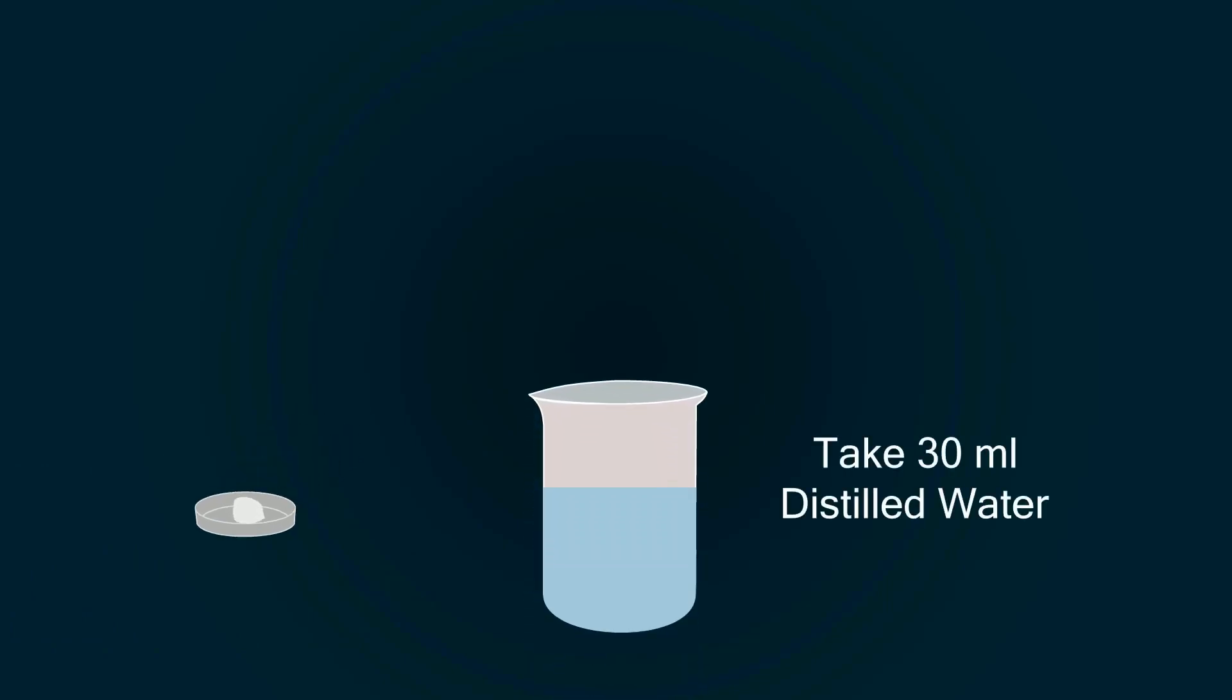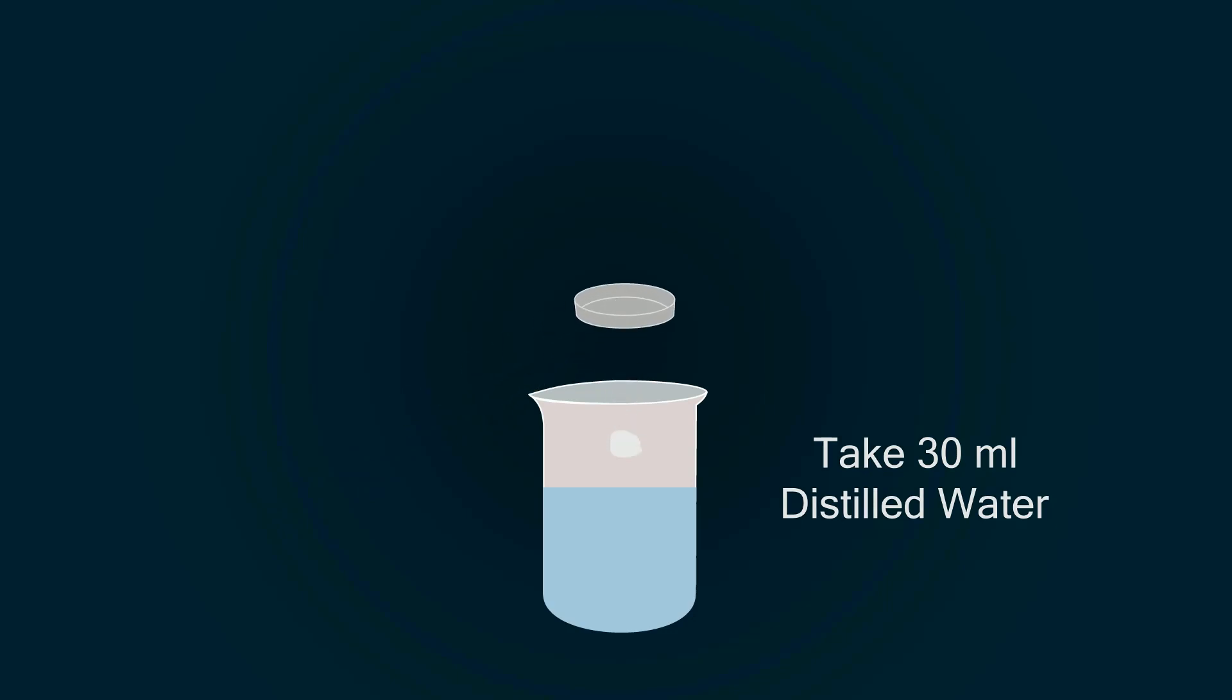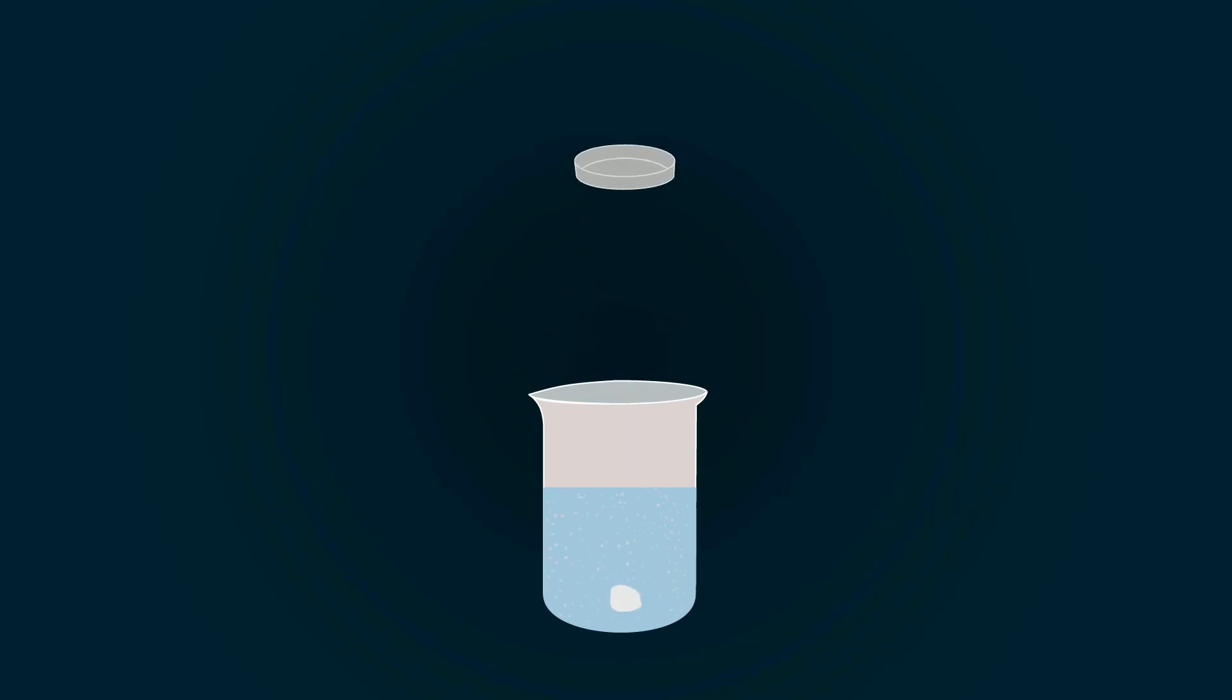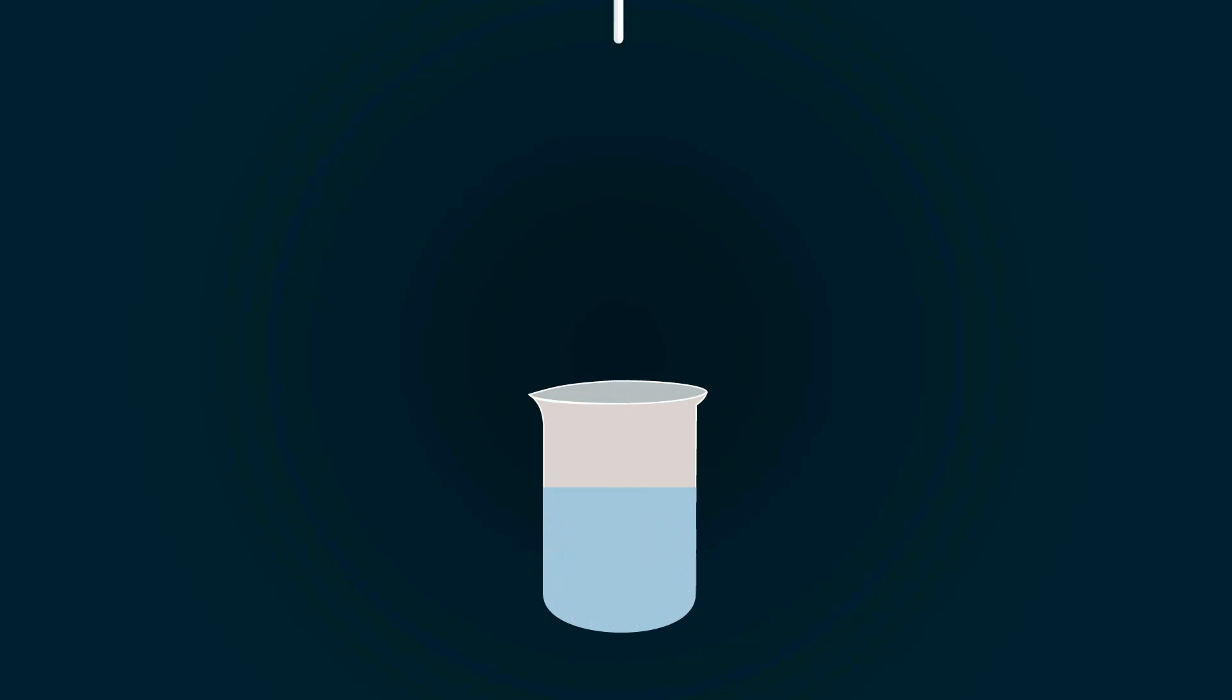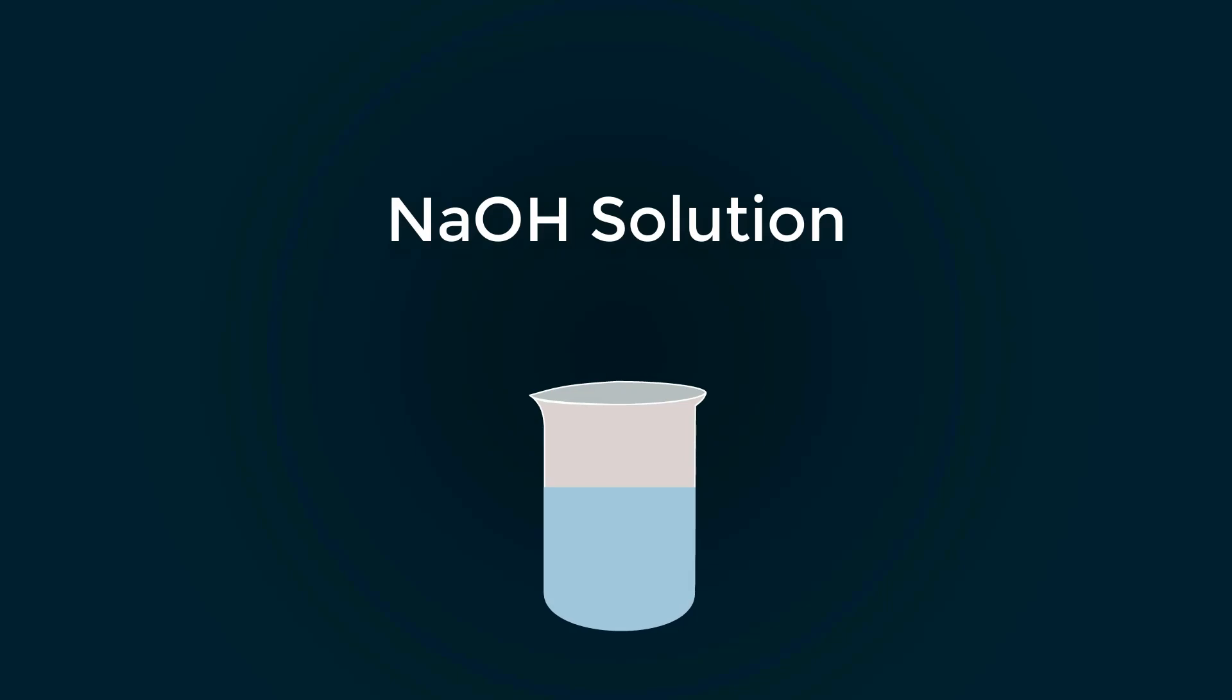Now take 30 milliliters distilled water into a beaker. Put NaOH chemical into it. Dissolve it with help of glass stirrer. Sodium hydroxide solution is ready.